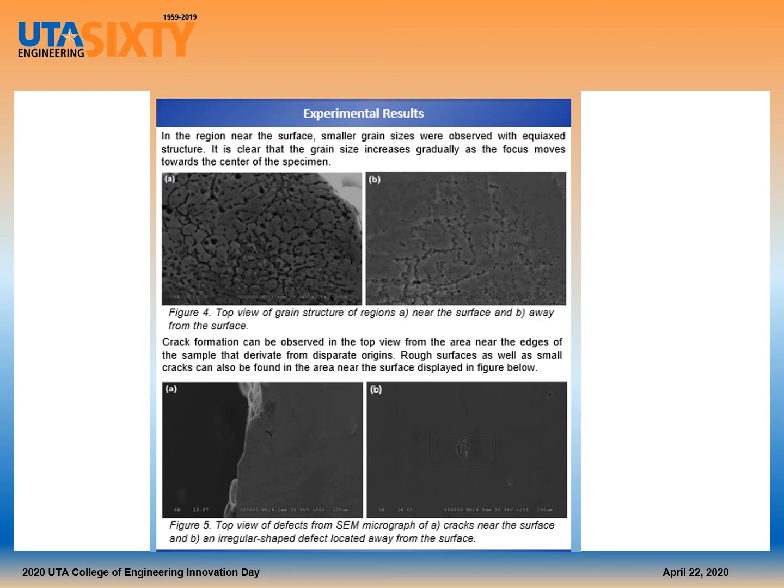Crack formation can be observed in the top view from the area near the edges of the sample that derive from different origins. Rough surfaces as well as small cracks can also be found in the area near the surface, displayed in Figure 5.